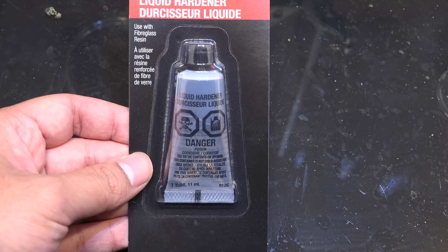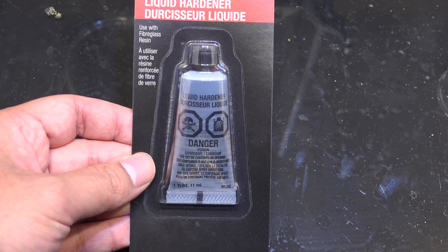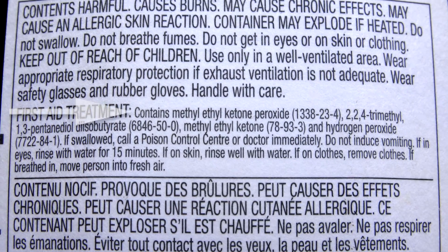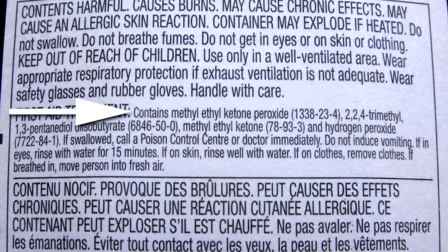Greetings fellow nerds. So I was at the hardware store and I noticed this package of resin hardener. This is used for initiating the hardening process of fiberglass resin and other polymers like styrenes. Its primary ingredient is an interesting chemical called methyl ethyl ketone peroxide.